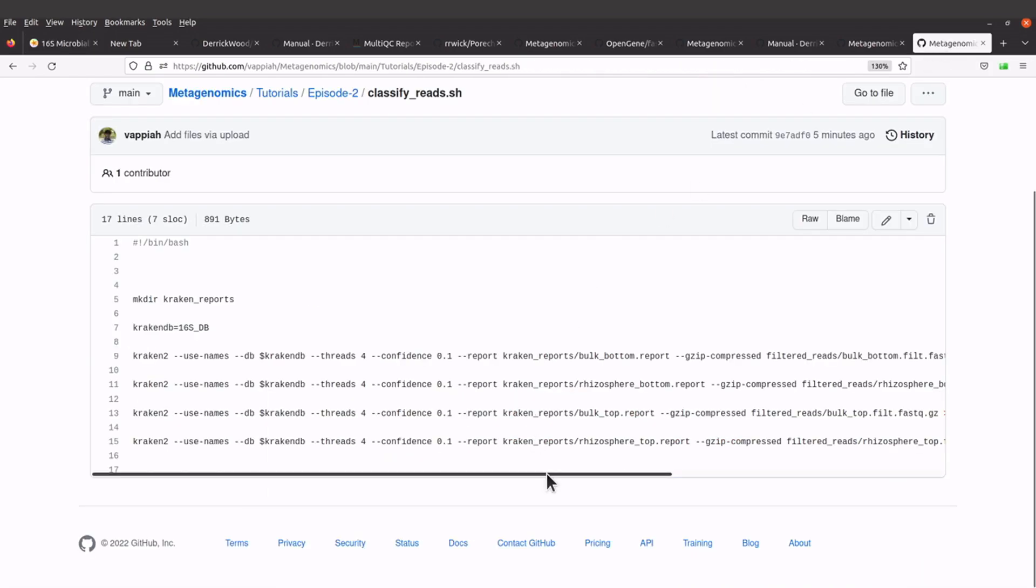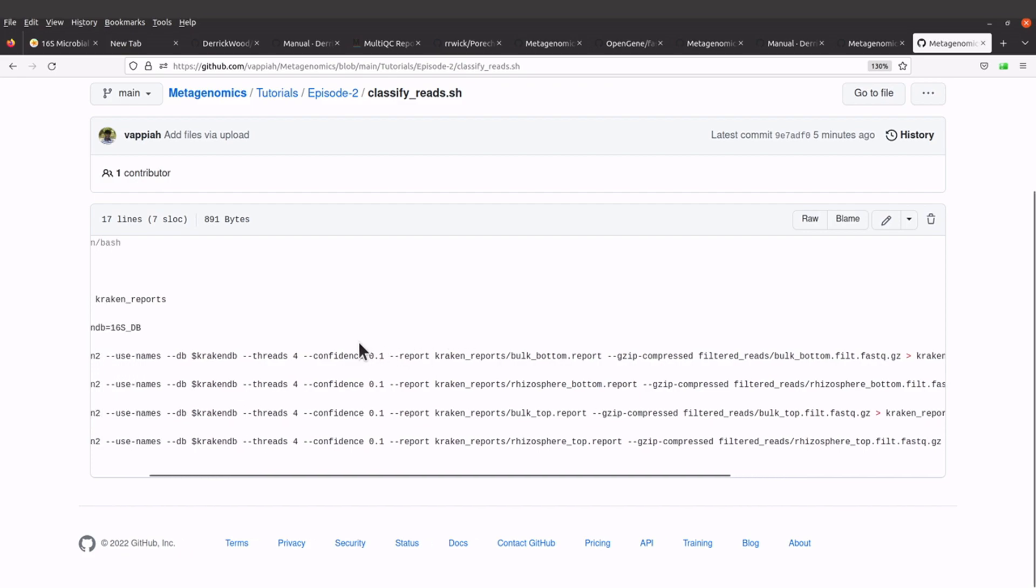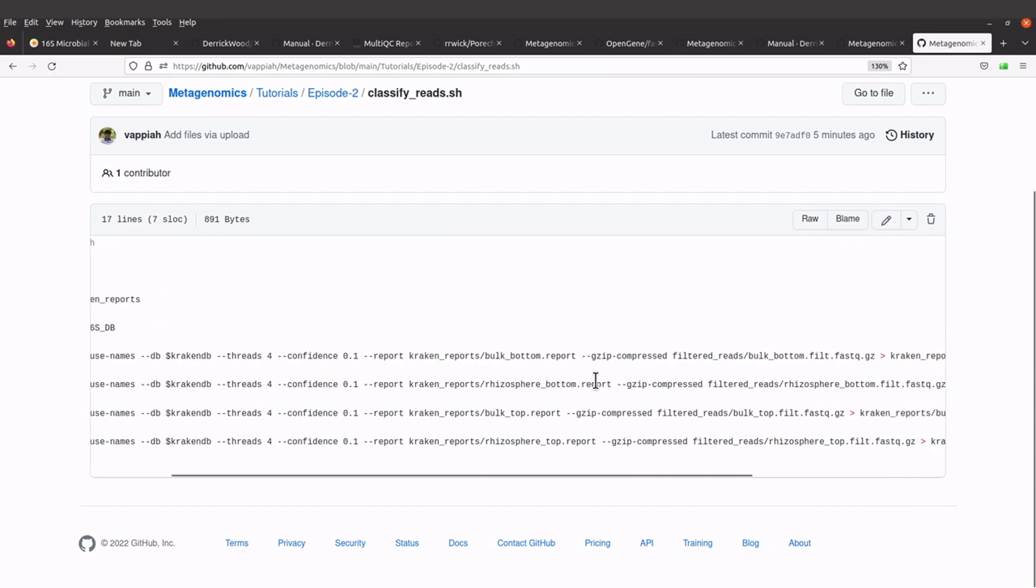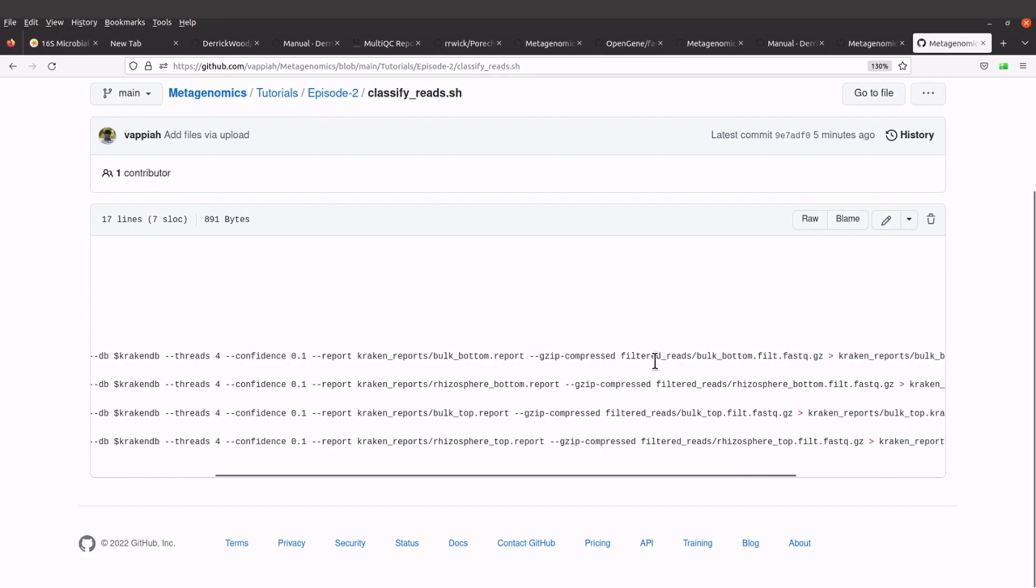And then I also specify the output file for the reports. We are saving the reports in the kraken_reports directory, the one that we created here. We also have gzip-compressed, so this flag tells Kraken that the input file we are using is compressed.